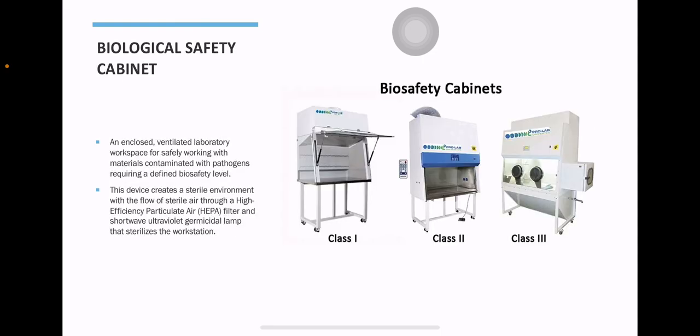Next, we have your biosafety cabinet. It protects you, the sample, and the environment. It uses HEPA filters, or high efficiency particulate air filters, to provide sterile airflow and may include UV light for decontamination. So this is essential for handling pathogenic organisms. So think of the biosafety cabinet as easy as PPE: personnel, the product, and then the environment. So it is a three-way protection.